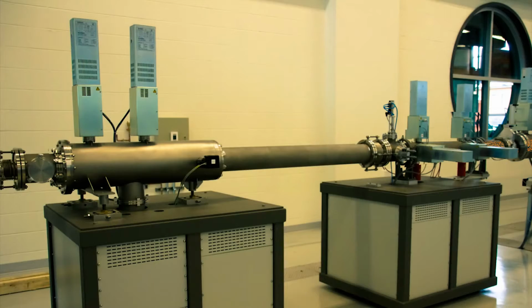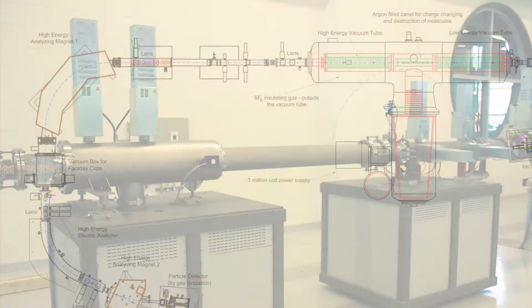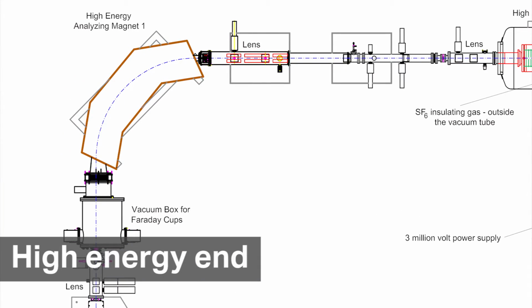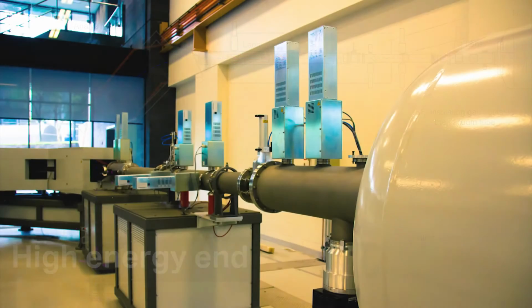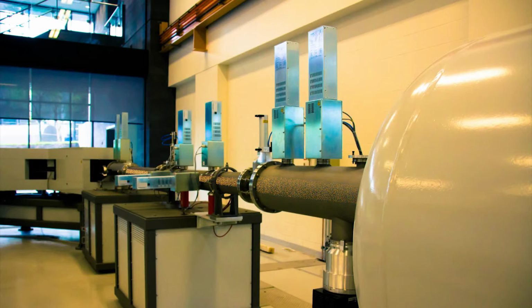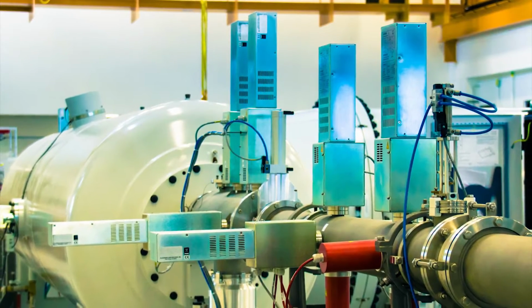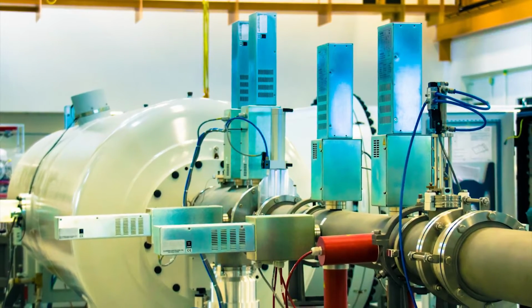Now we're going up to a few percent of the speed of light, so our ion beam is really rocketing. As we're walking over here now to the west side of the machine, we're at the high energy end. Our ion beam is racing out as the flight path goes into a magnet, and we've got a few control centers along it. These are electronic lenses, so we can change the shape of that beam.